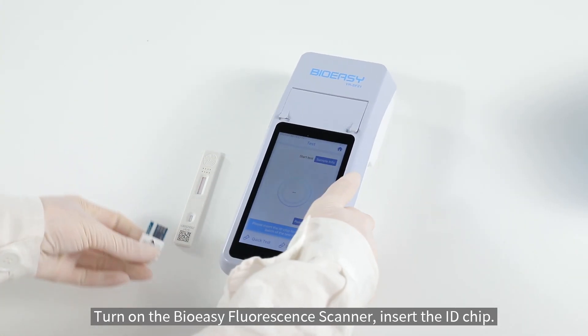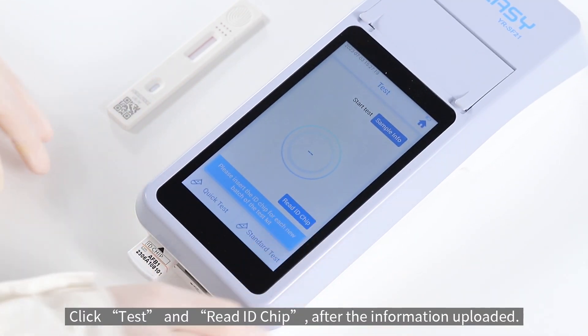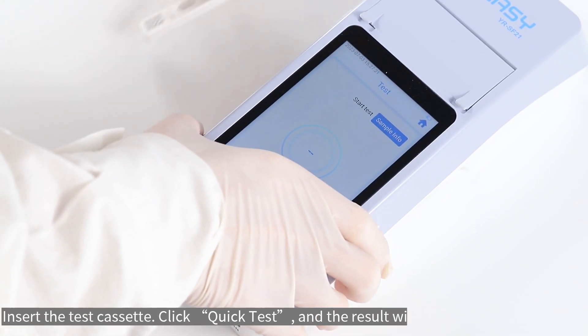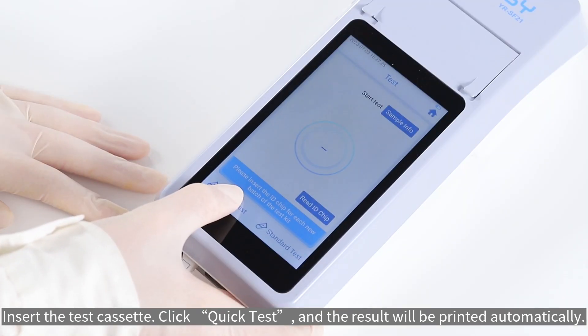Turn on the Bioeasy fluorescence scanner. Insert the ID chip, click test, and read the ID chip after the information is uploaded. Insert the test cassette, click quick test, and the result will be printed automatically.